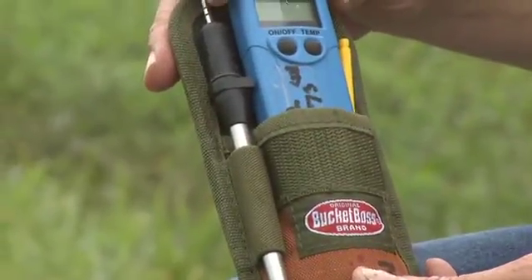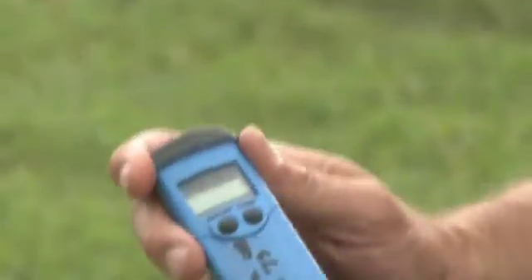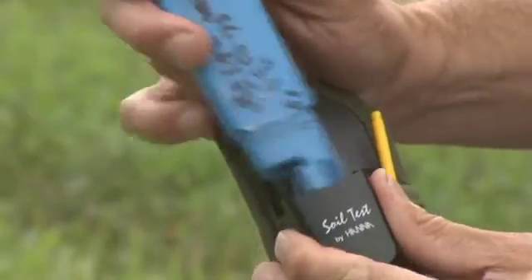We're going to go over use of the EC probe and how to operate it. First, we take it out of the holder. It's going to have a black cap on the bottom and you simply remove it like that.